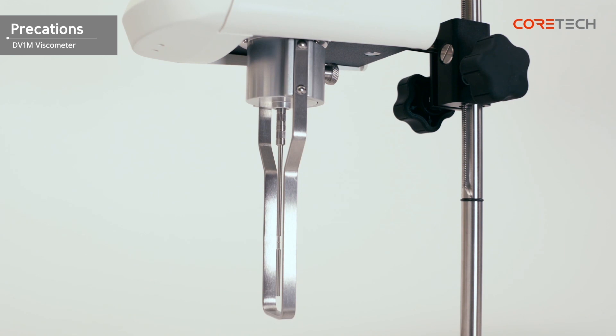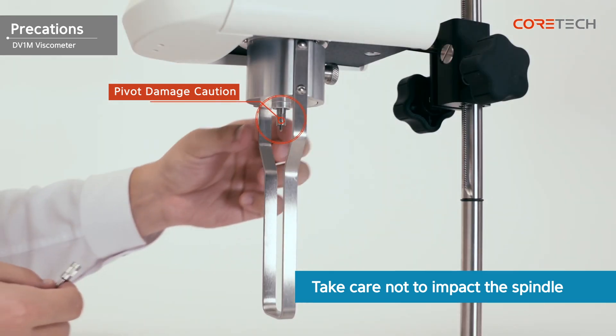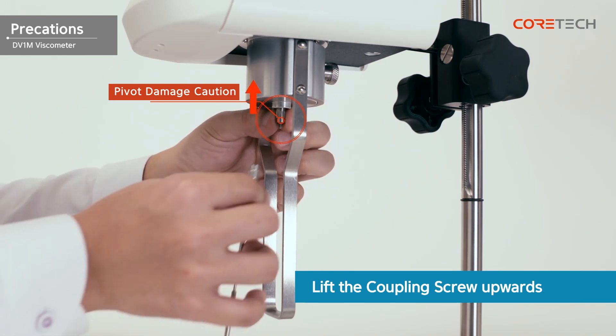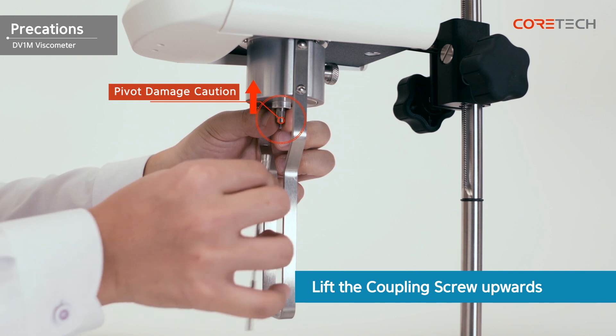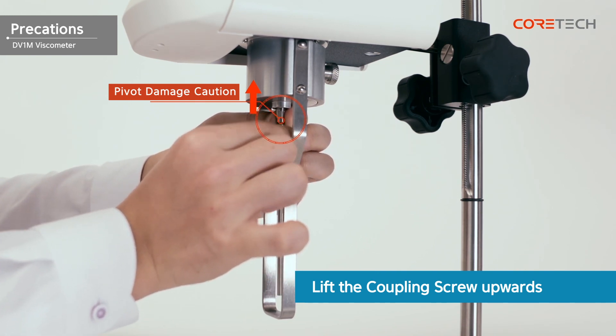Be careful not to shock the spindle while it is engaged. If the spindle is impacted, the pivot is more likely to be damaged. When combining or removing the spindle, the coupling screw must be held upwards to prevent damage to the pivot. If the pivot is damaged, contact the place you purchased it or Core Tech Korea's A/S service. In the case of pivot damage, even if there is a free repair period, it will not be repaired for free.